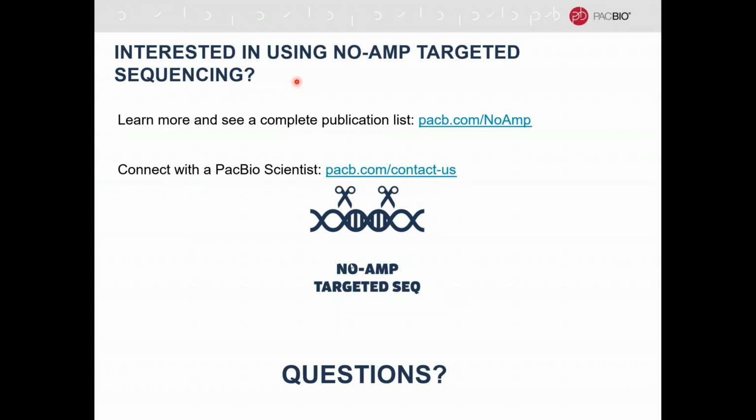It really depends on whether the PCR you're using is an in-house assay, or if you're purchasing the assay. If you're purchasing the assay from companies that develop them, especially for these repeat expansion diseases, the PCR cost alone can be a couple hundred dollars. Jenny, do you have a sense of that? Yeah, it really depends. Most people will get actual commercial kits, and they're of course priced more highly. Generally, especially with repeat expansions, it's quite difficult to design these primers.